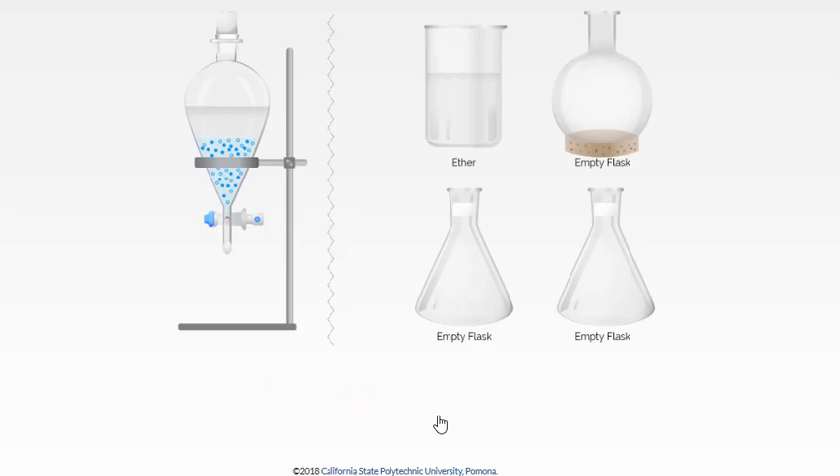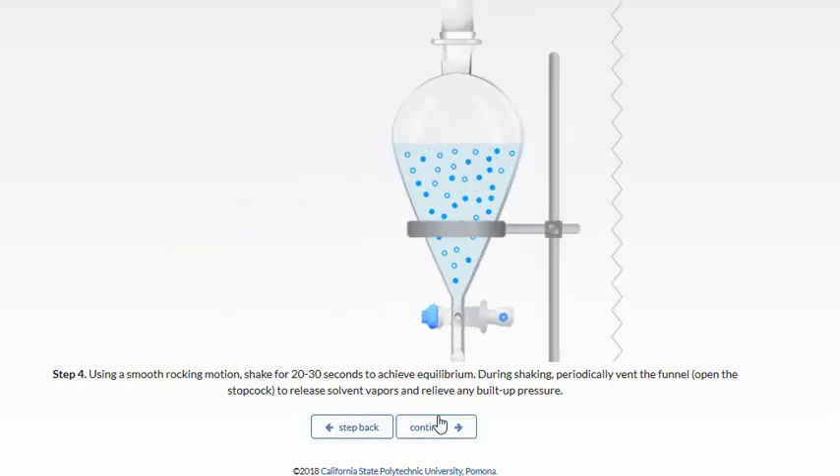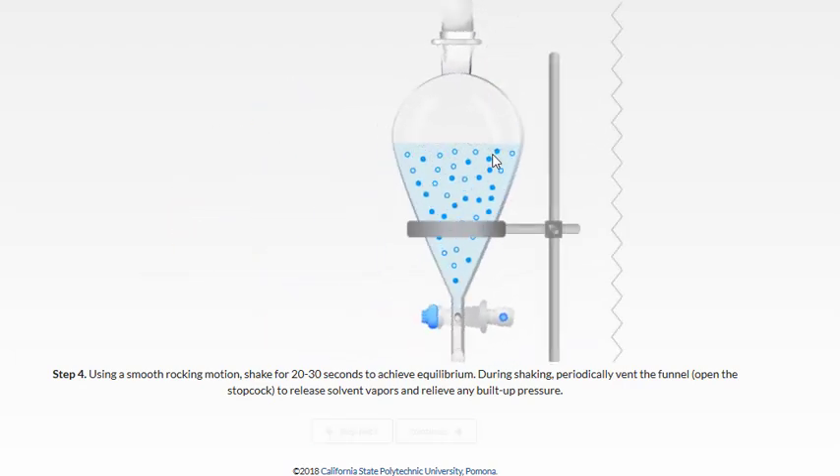We're going to put a stopper on top and remove the funnel from the support ring. Mix it gently at first, then more vigorously to achieve equilibrium. Put your finger on top of the stopper to make sure it doesn't come loose. You also want to periodically open up the stopcock when the sep funnel is upside down to release any built-up pressure or gases — especially when using sodium bicarbonate in your aqueous layer, which will definitely generate carbon dioxide.